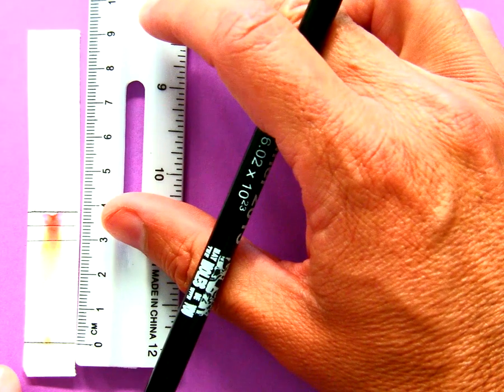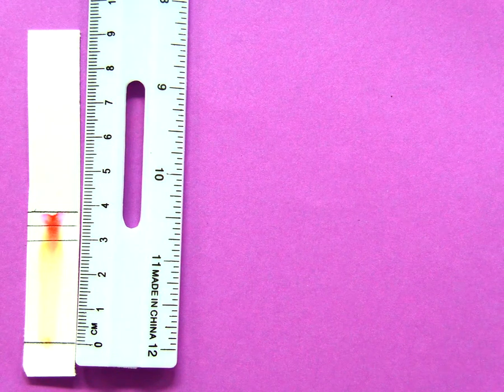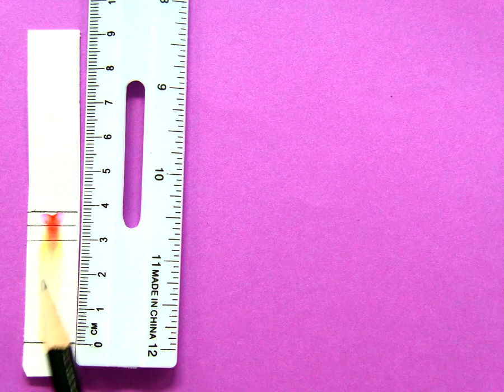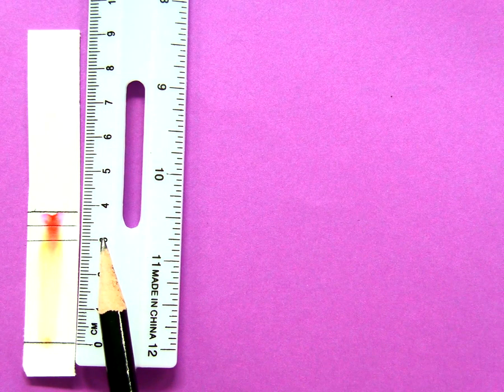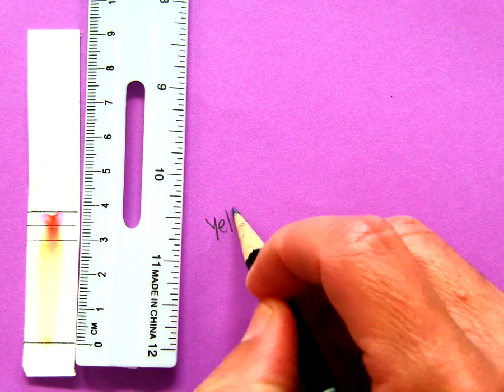So we're going to line this up with the 0. And remember that you're always going to make one guess whenever you make a measurement. So if I'm looking at the yellow right here, I can see that the yellow traveled pretty much right on the 3. So I'm going to guess that it's 3 centimeters. So I'm going to write yellow here.